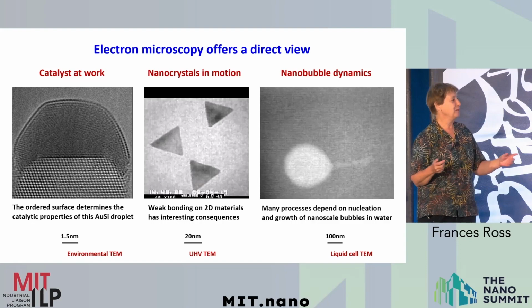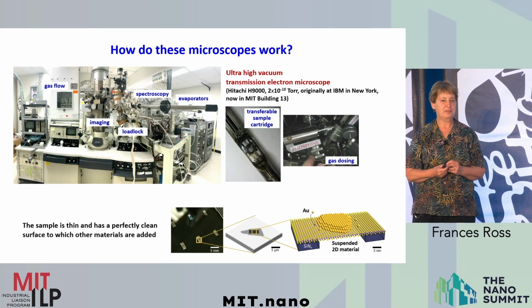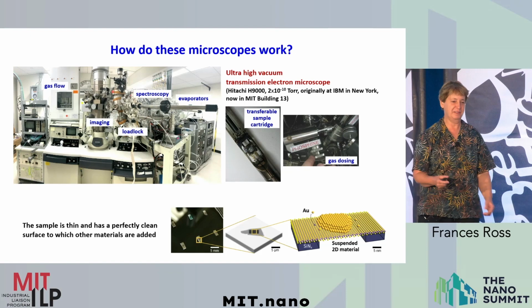So nanobubble dynamics, you can see it in the microscope if you trap the liquid between two windows and record a movie of it. So how do we do these kinds of experiments? This is a microscope that's at MIT. This one was built at IBM. I moved from IBM to MIT, and I was fortunate to bring the equipment with me. For some reason, nobody else wanted it.